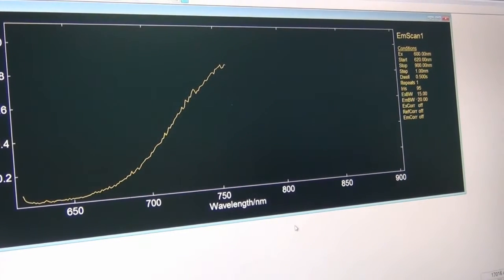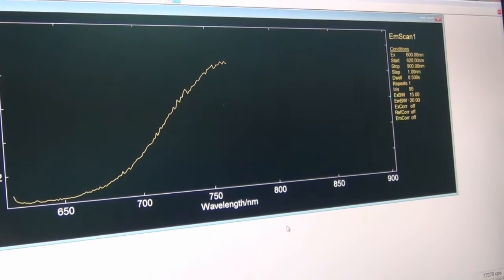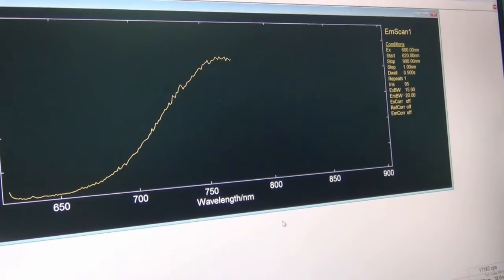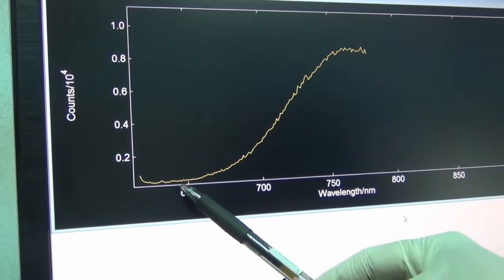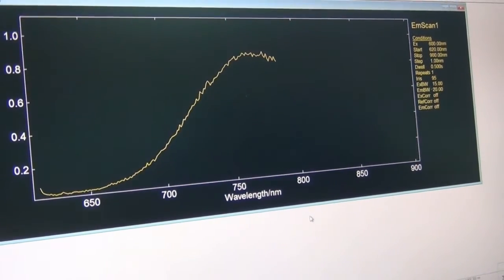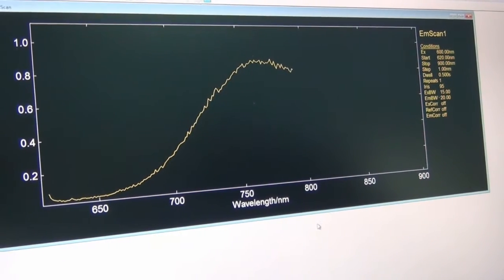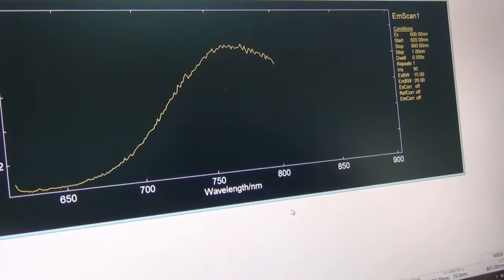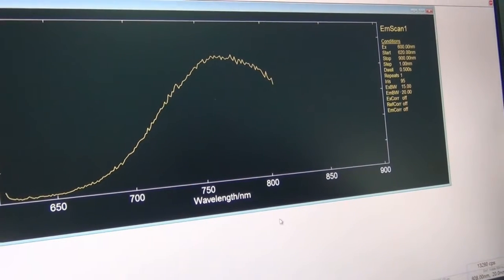As you can see, the graph is forming a bell-shaped graph. This is half of the bell-shaped graph, so now it's going down. The PL count is going down. This is photoluminescence count times 10 to the power of 4. This is the wavelength. So it's going down right now. Wait until the measurement ends.